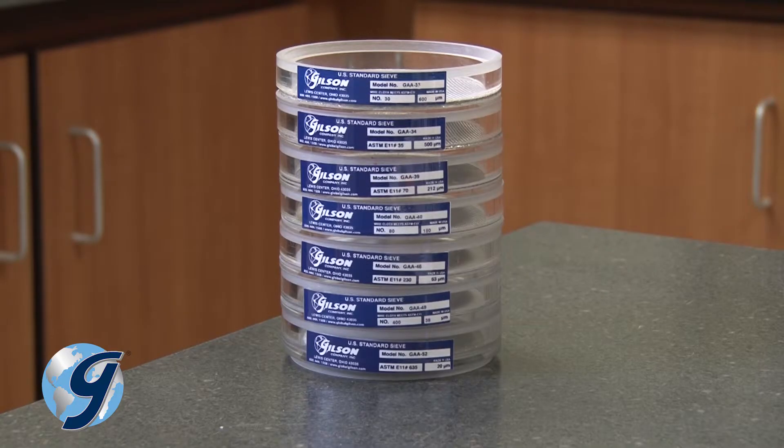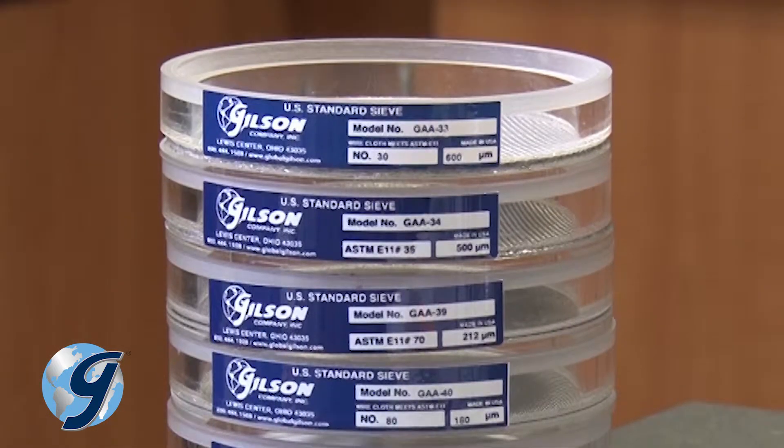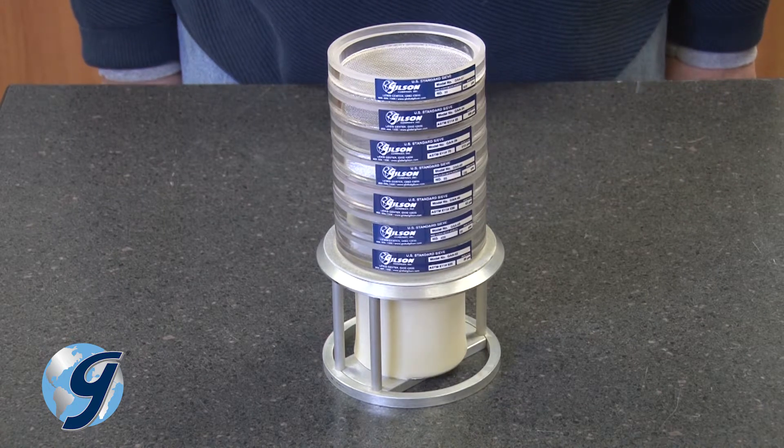Now nest the stack of sieves to be used — finest at the bottom, coarsest at the top — with spacers as necessary to maintain the correct stack height, and place the sieve stack on top of the fines collector.